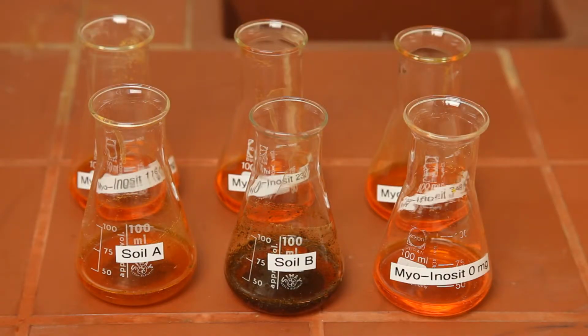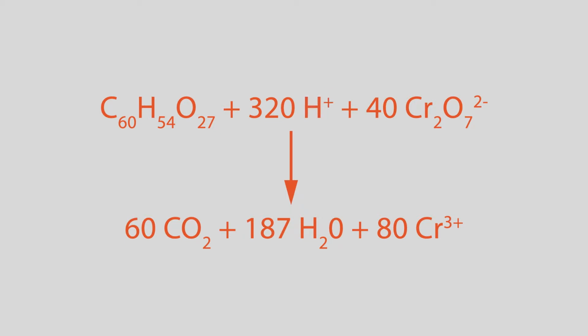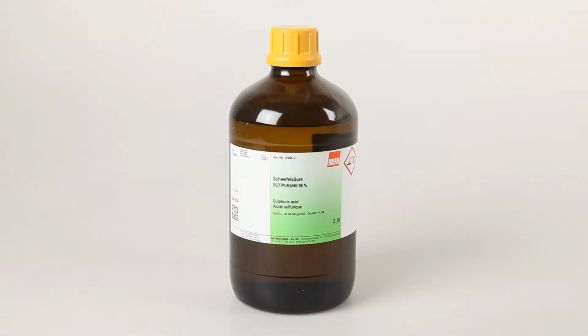So far, nothing happens. The reaction requires the presence of protons. Therefore, we have to add a strong acid as well. We use sulfuric acid for acidification.